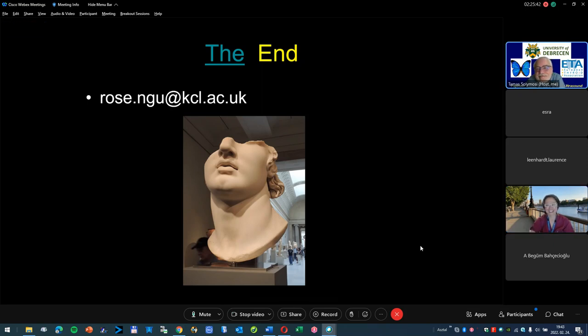Okay. Other questions? On-site cytology has a great impact in the thyroid, because the thyroid belongs to those fields of cytology where the non-diagnostic reports are quite high. One possible solution is that a clinician makes a rapid staining, quick Diff or Giemsa staining. It requires 2 or 3 minutes to get a result, and naturally it is not enough to give a cytological diagnosis, but it is enough to reveal whether the aspiration was non-diagnostic or not.